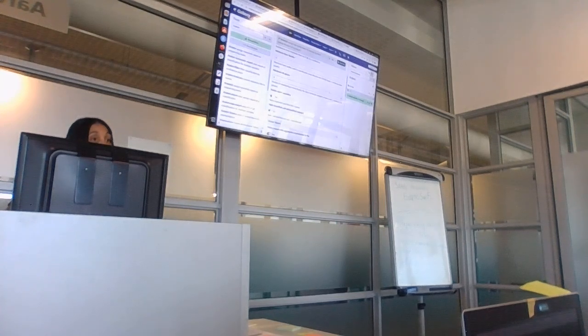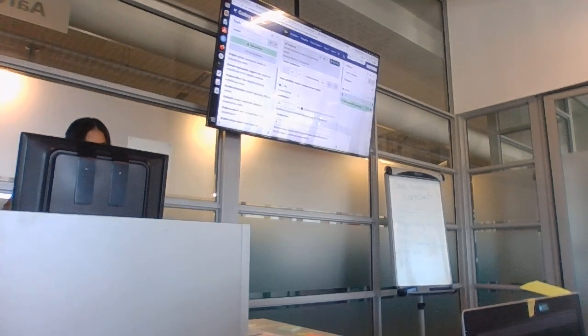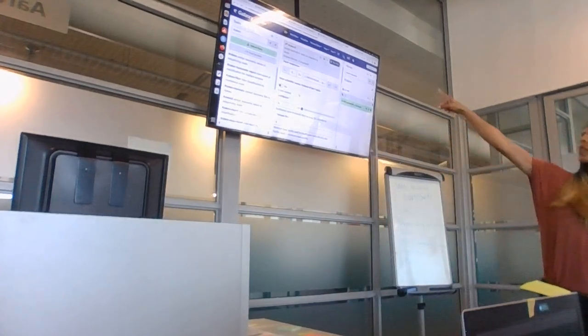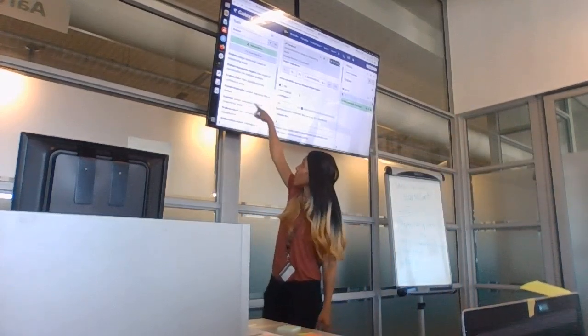You want to look at the parameters. The database, how do you use this? Oh, the database is at the bottom here. Select the Kraken 2 database. No. Before that. Just the 0.1, how do you get to the confidence? Are you asking how you got to Kraken? You search for the tool Kraken 2. You can just type Kraken 2, then you won't even get the other option.